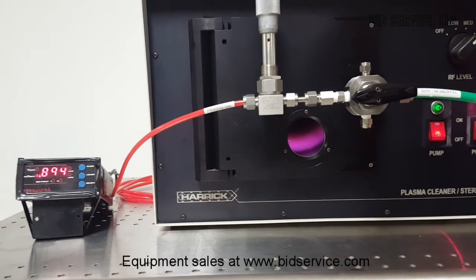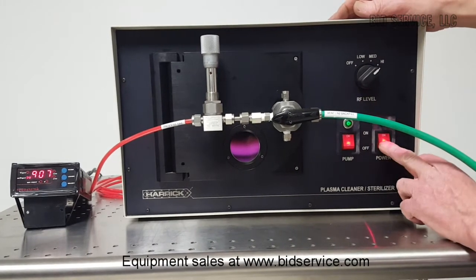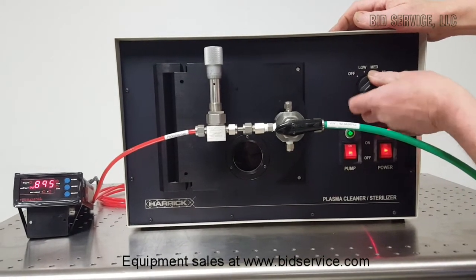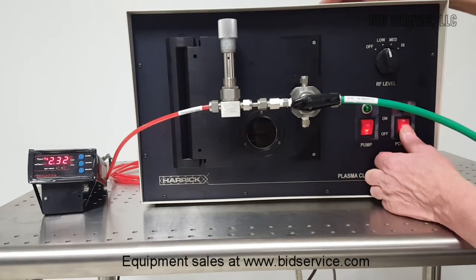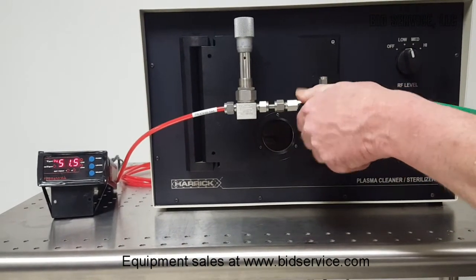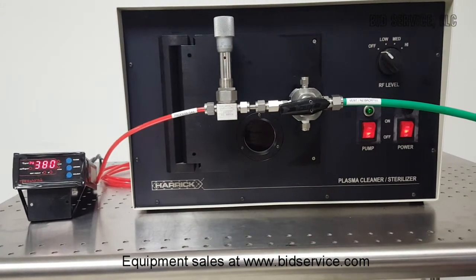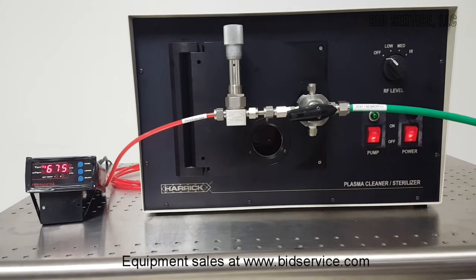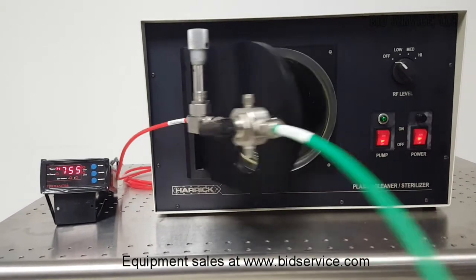When your process is complete, you can leave this preset. Turn off your RF supply, then turn off your pump. Turn your valve back all the way to the right side, which will vent the chamber. We are just about back up to 760 torr, which is atmosphere. Then you can open your chamber.